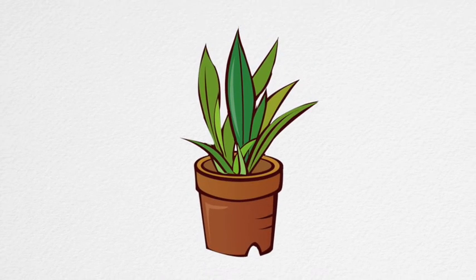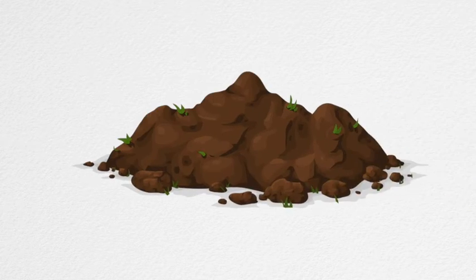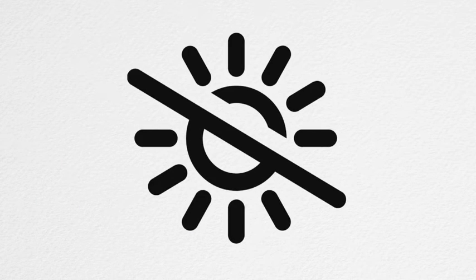The control for this experiment would be the plant placed upright and erect, perpendicular to the ground, so that it acts as a basis for comparison to the experimental group, which will be placed parallel to the ground on its side. Some constants for this experiment would be the soil used, the species of plant, the amount of water used, the location of the experiment, the humidity, the temperature in the room, and the environment used, which in this case refers to that each plant has no light, since we don't want phototropism to possibly affect our data.